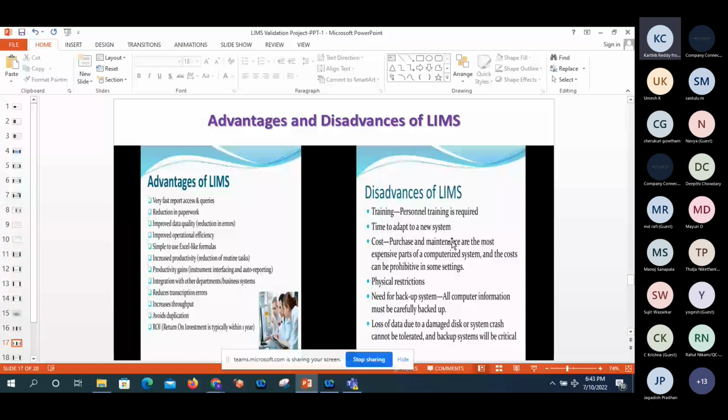A disadvantage is that training can take more time for the end user to understand things and adapt to the new system.